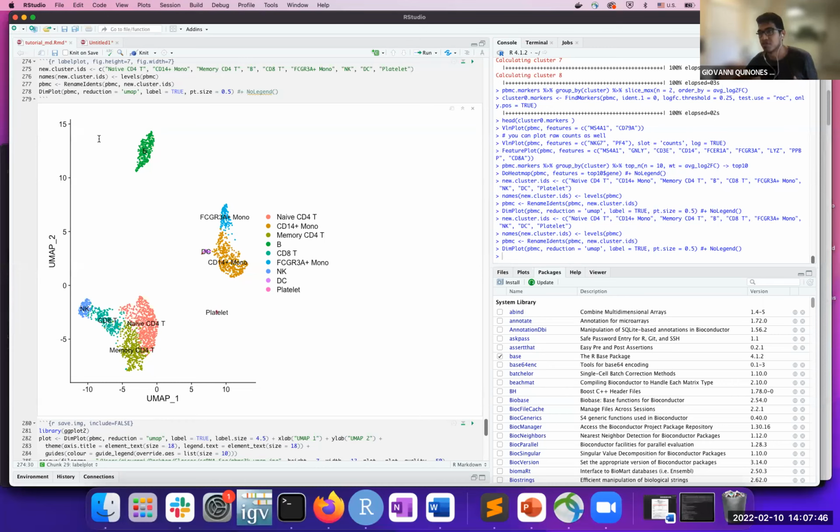And once you have produced this plot, this is finally the place where we wanted to get to from the beginning. We started with a population of cells, over 2,700 of them, and we had no previous knowledge of the composition of these cells, what type of cells they were, and so on.